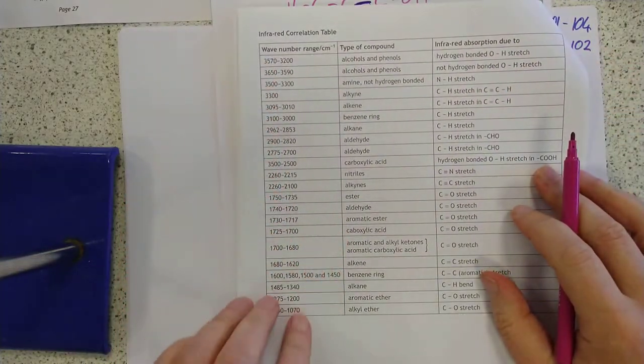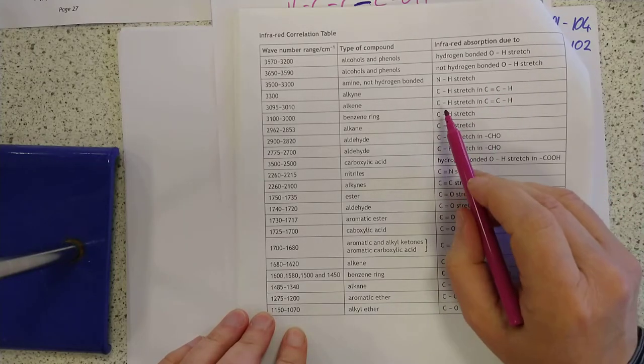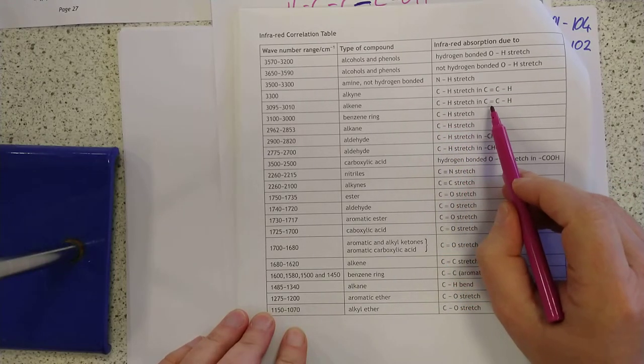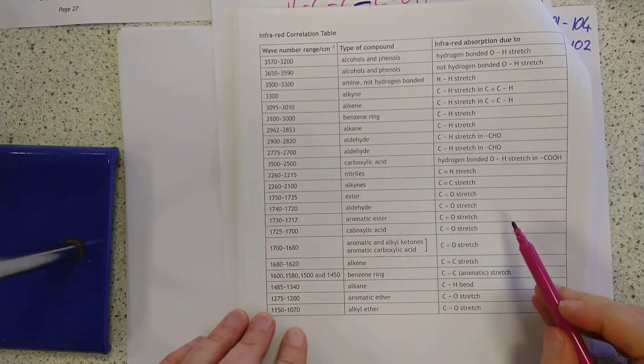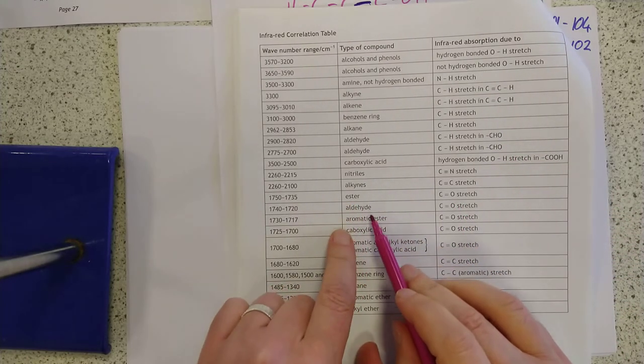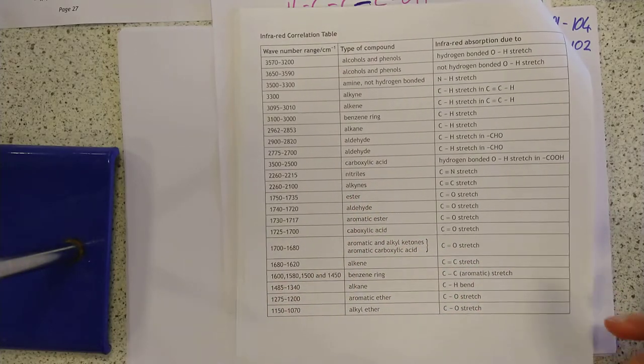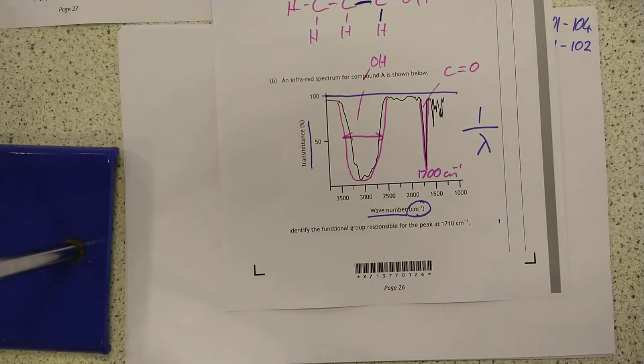And here are your wave numbers. Here are the individual bonds that are stretching. Sometimes they clarify them: a C-H stretch in a double bond or a C-H in a triple bond. Sometimes the carbonyl can have slightly different wave numbers depending on what type of molecule it's in. But as I said, those two are the favorites for them asking about.